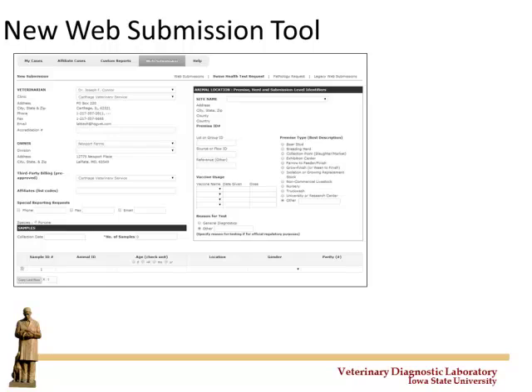Okay? And the idea there is, the practitioner logs in as themselves, and they have to have pre-populated their sites for them to show up. Okay? Then they'll click on this, and all of their sites will show up, and they'll click on the site that they want, that's submitting or whatever, and then it'll pull all the correct information in about that site. Okay?